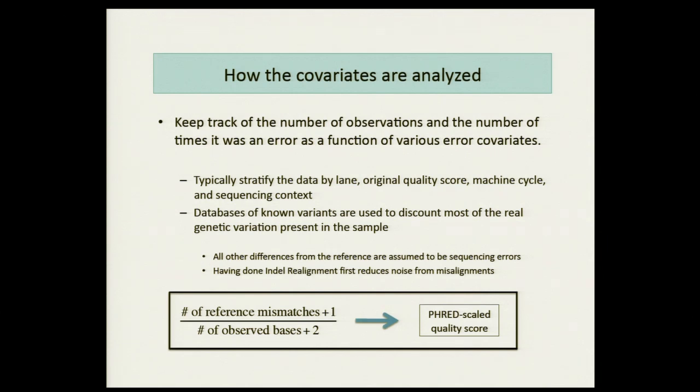So is this very much dependent on the DB? I'm sorry, I really can't hear you at all. This is dependent on the dbSNP? Right, so it uses dbSNP to discount these. That is not in dbSNP, then we can't.